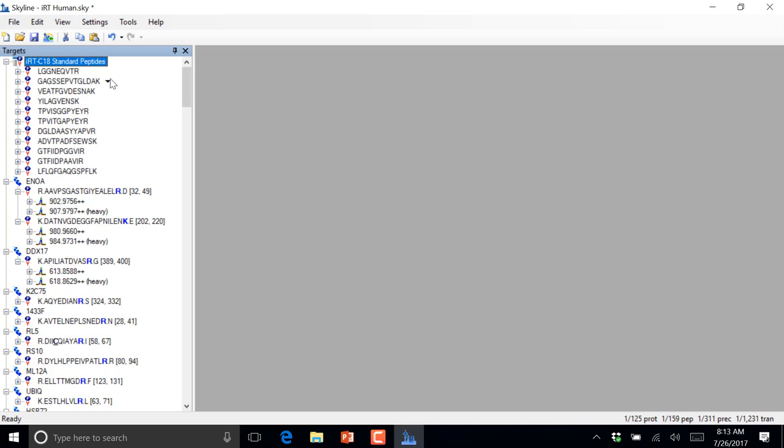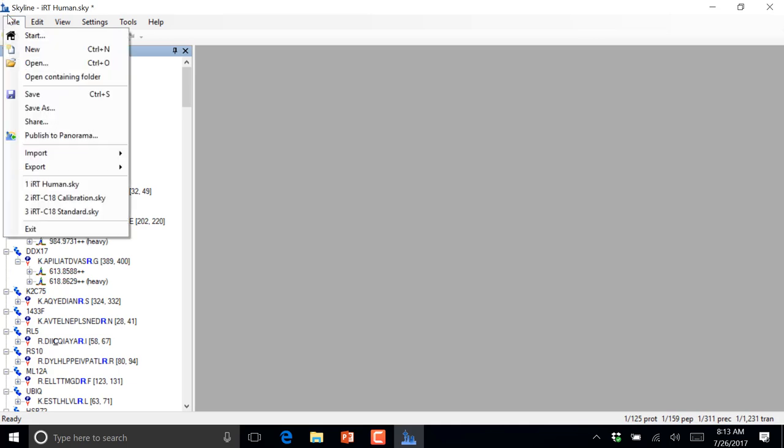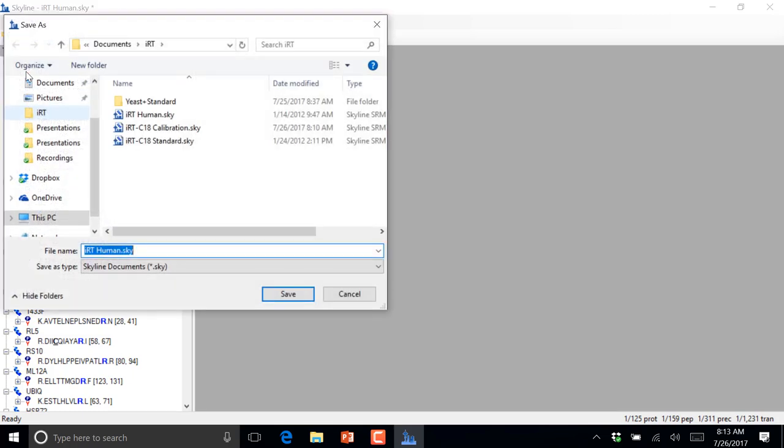Let's go ahead and save this as a new thing. File, save as, IRT human plus standards.